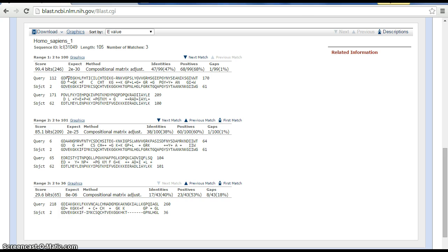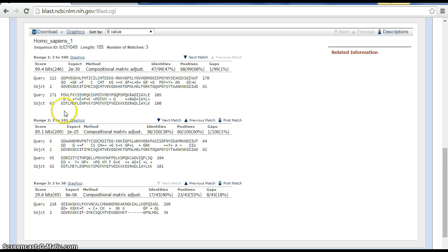For instance, you would have a P instead of a V, you would have a V instead of an E, and so on. That's how you can compare to see where the chimps and the humans are different for this particular protein.